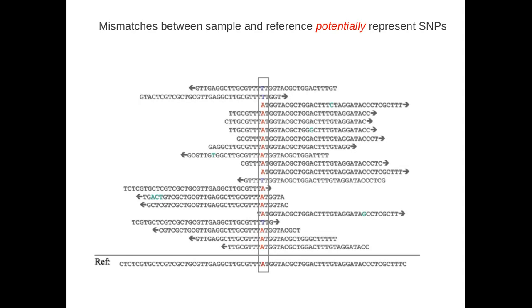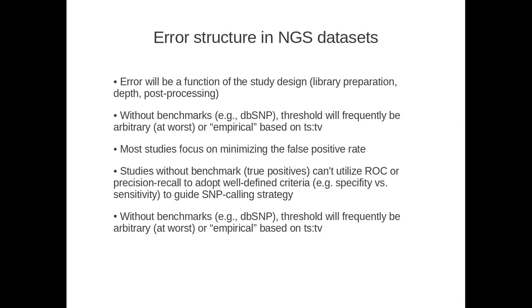However, we know from real data that there are lots of problems with the mapping. And so that leads to this topic that I want you to be aware of, and that is the basic idea that there are lots of potential pitfalls and errors in these resequencing data sets, and we need to be aware of them to have the highest confidence in our SNP call sets.